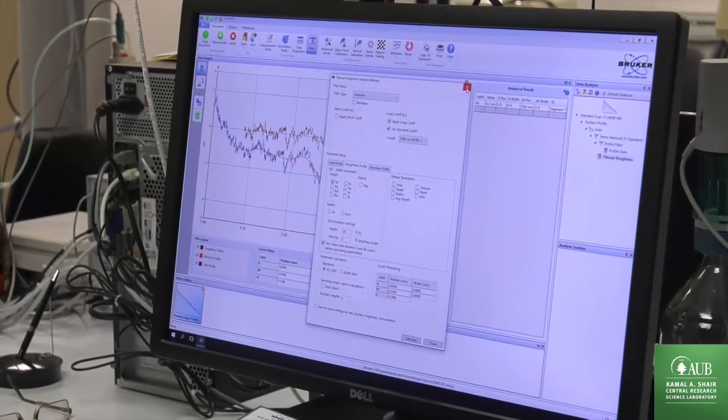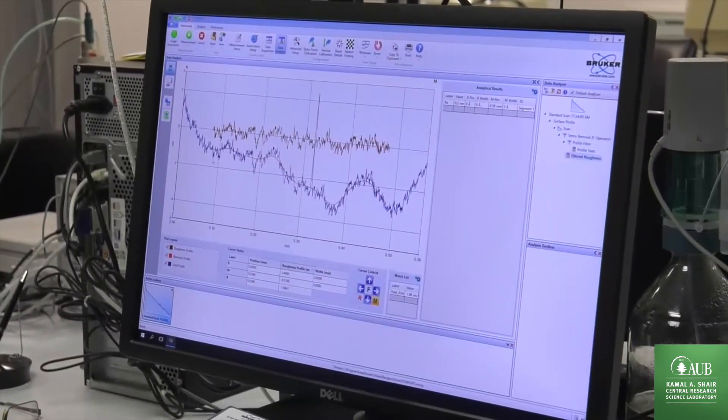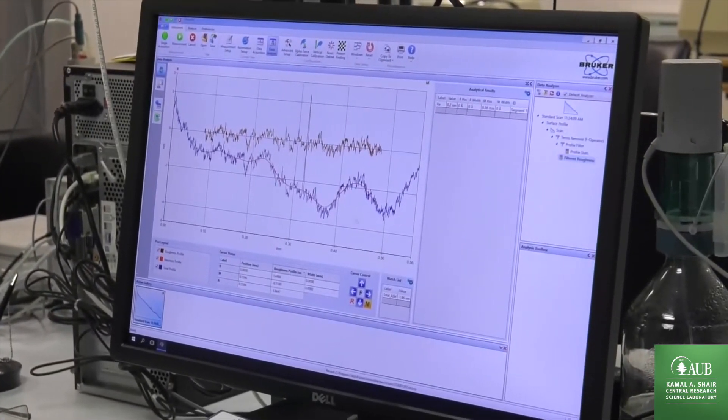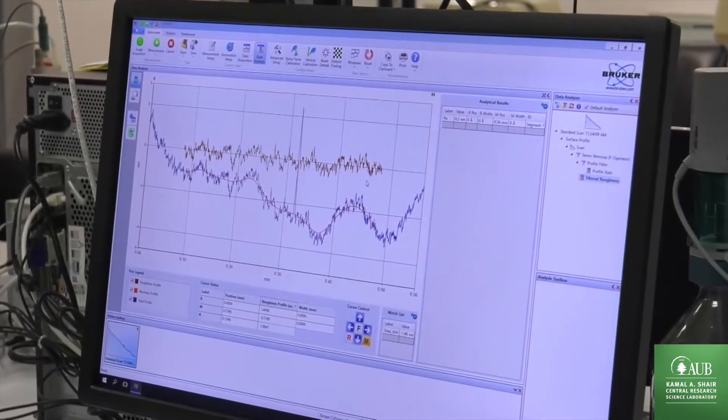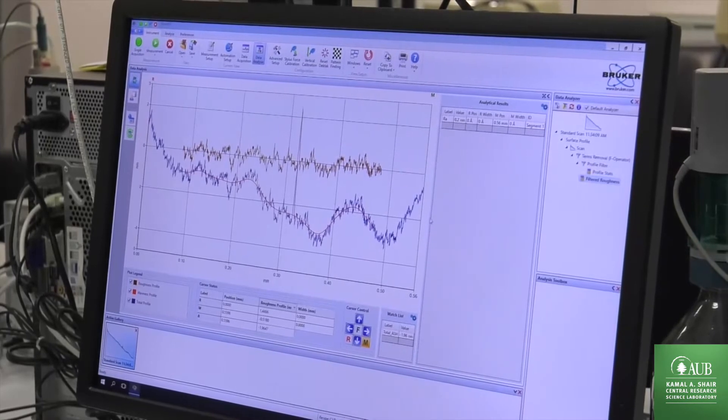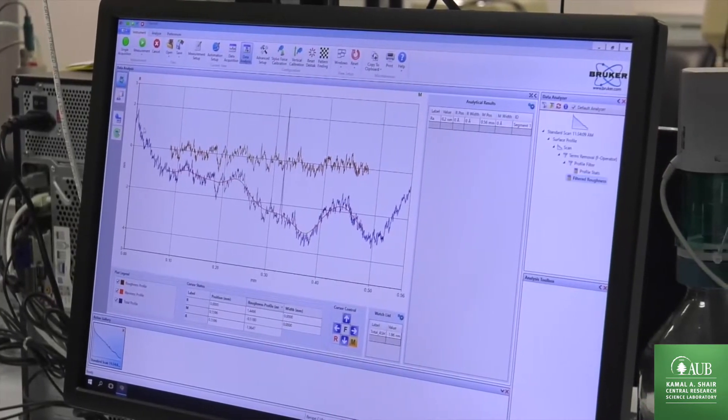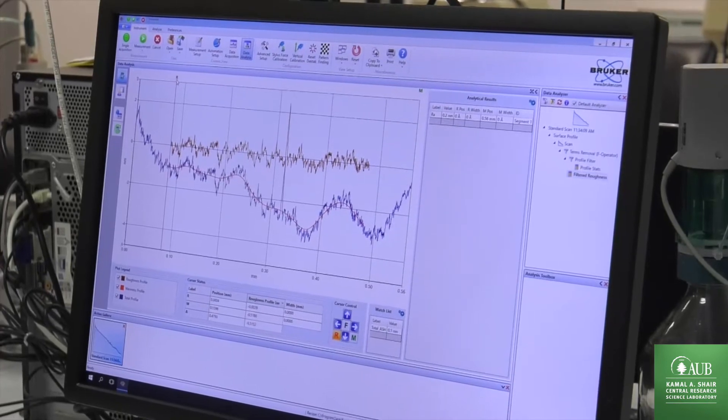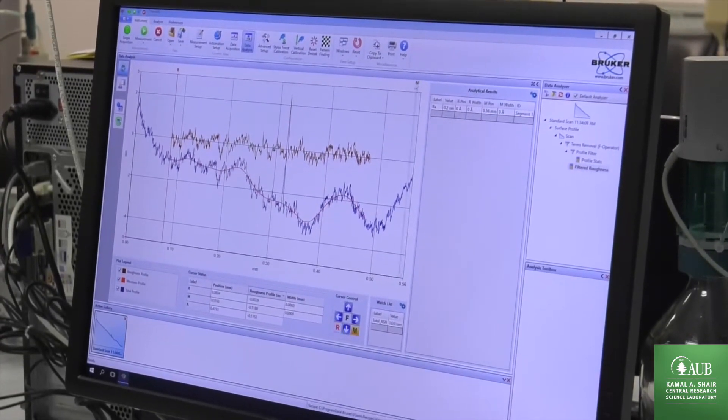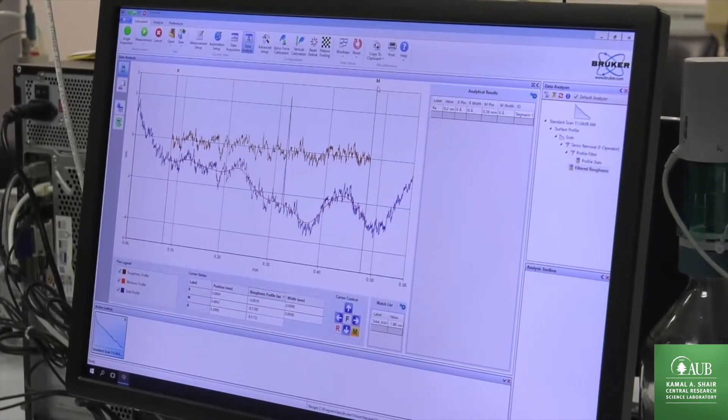And I got in my central 5 sevenths of the scan lengths, I get the waviness profile and the roughness profile, but I get the roughness calculated between the cursor positions, so all I have to do is now adjust the cursor positions to that section of the scan where the waviness has been subtracted.